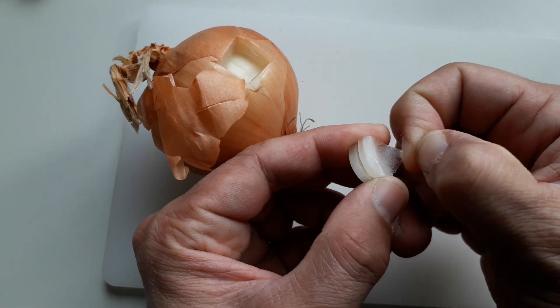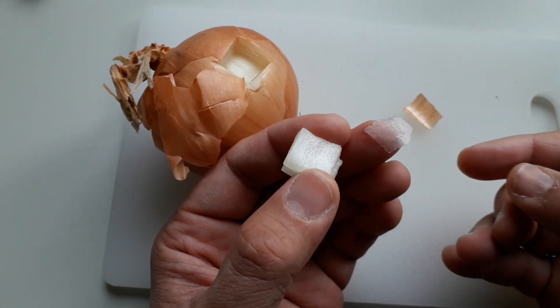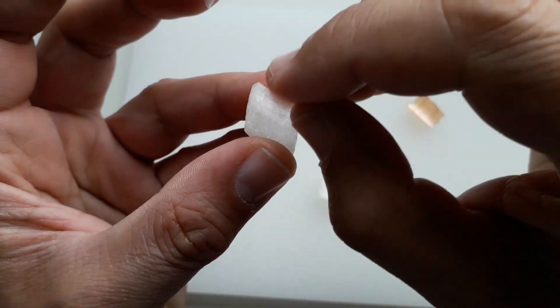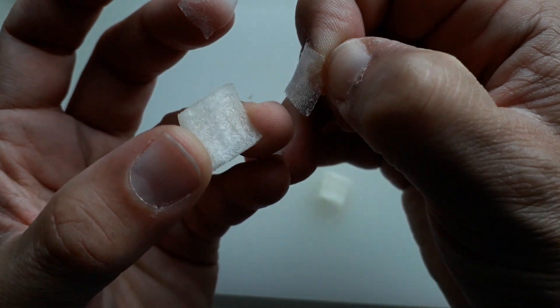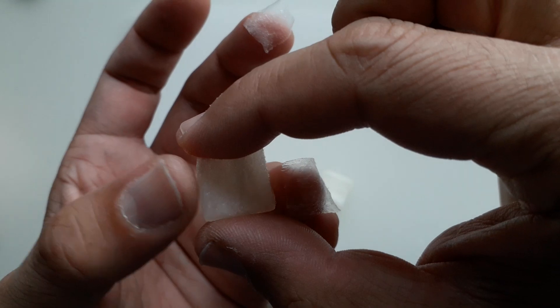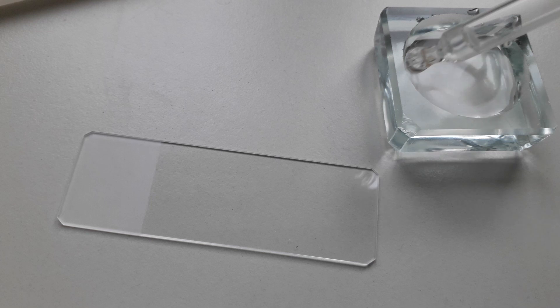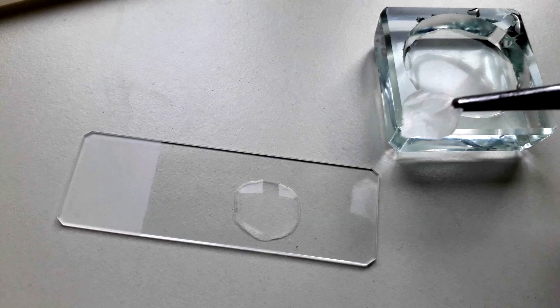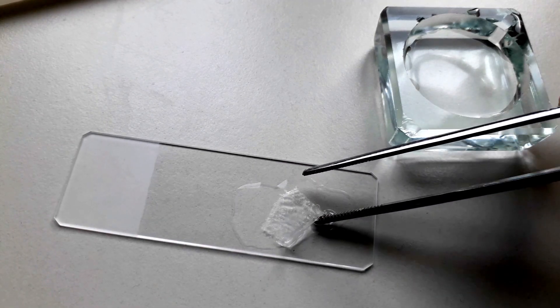They drop out quite easily, and what I'm interested in is observing the so-called onion skin, which can be taken off quite easily with your fingers. You can see it peels off and this layer is only one cell layer thick, which means it's perfect to be placed under the microscope. You can see that the inside skin peels off quite easily, and this is then going to be put on a microscope slide.